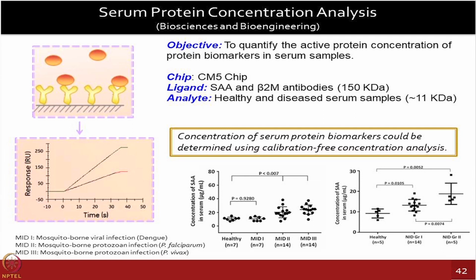This is from one of the malaria projects, where we had patients suffering from either falciparum or vivax malaria or dengue fever, and we wanted to measure the level of one of the proteins, serum amyloid A, and see how that protein concentration is different in different conditions. Because we already had an idea for this protein from our other discovery data set, we felt pretty confident that we could now measure it.